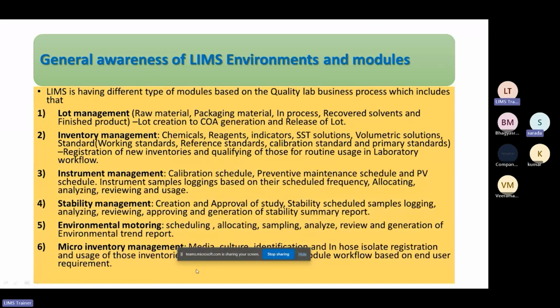So let's see some LIMS modules. What are these different modules? Modules means the functioning of that particular LIMS software, what it actually provides to an end user when we are working with it. The first thing is lot management. Lots like raw materials, packaging material, whatever the testing is. The COA generation and release of that COA comes under lot management.